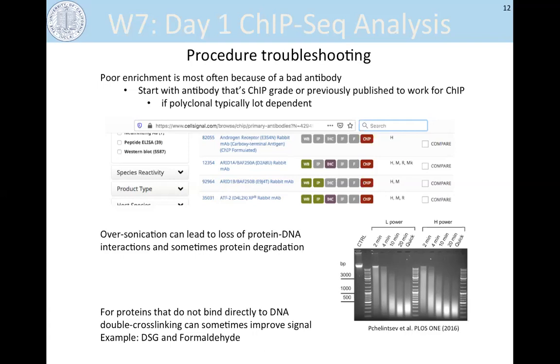For a transcription factor, it might digest away too much of the DNA, like a small factor, and so you're going to get fragments that are too small to map. So for histones, I think it works great, but with histones, cross-linking or sonication is never an issue anyway. And Pol2, as I mentioned, it can be degraded from sonication, so I see that as a workaround. And apparently you say you've had experience with that, so that's good to hear.